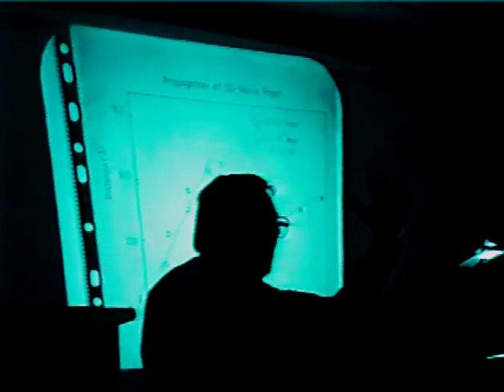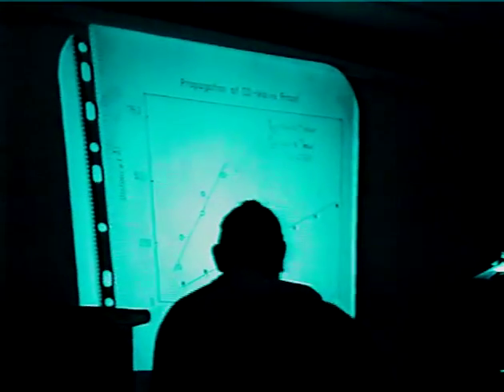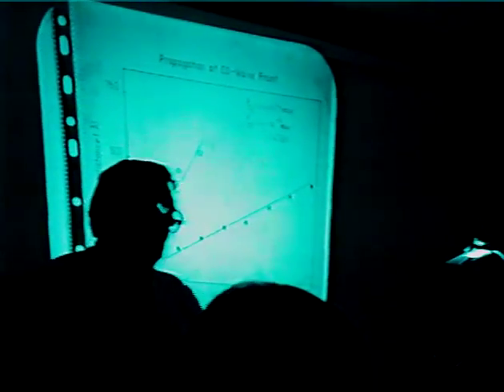The time resolution of these images is about 40 milliseconds, and the fast switch-on reaction where we saw the carbon monoxide immediately coming to the surface is this one here. And the waves of oxygen are the smaller one. So one can measure these. It's about 5,000 angstroms per second, which the carbon monoxide moves.